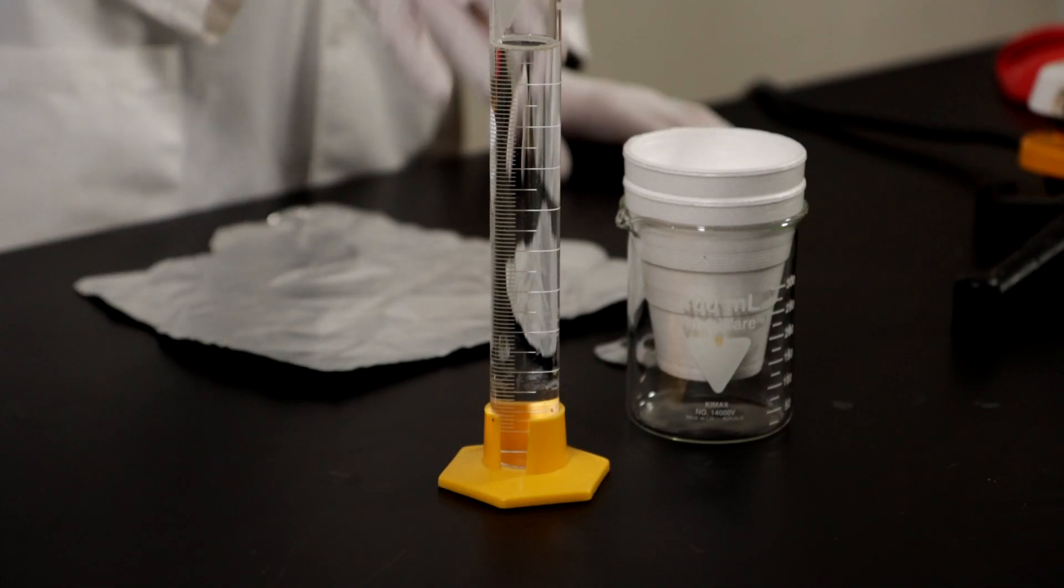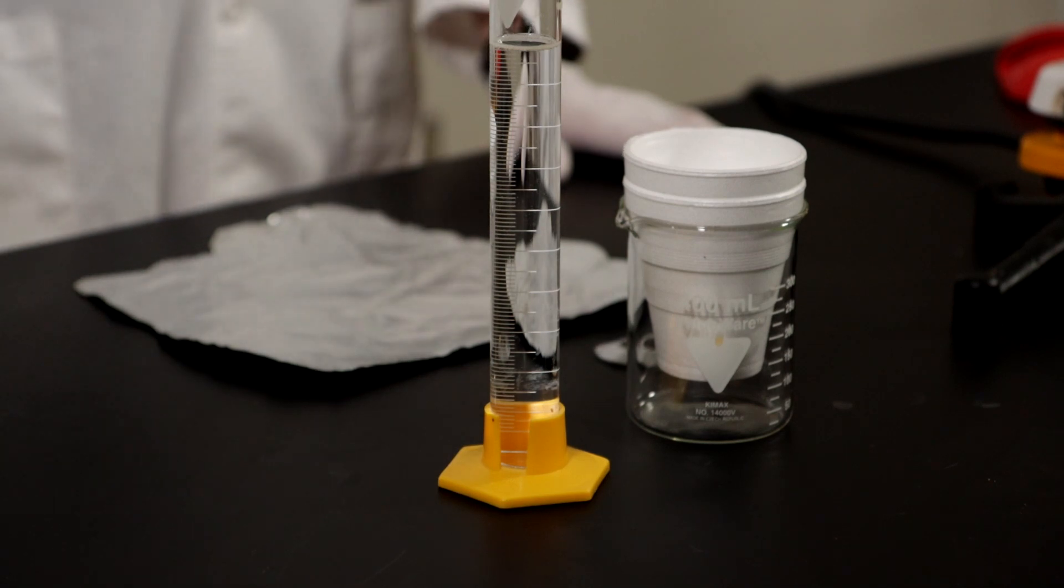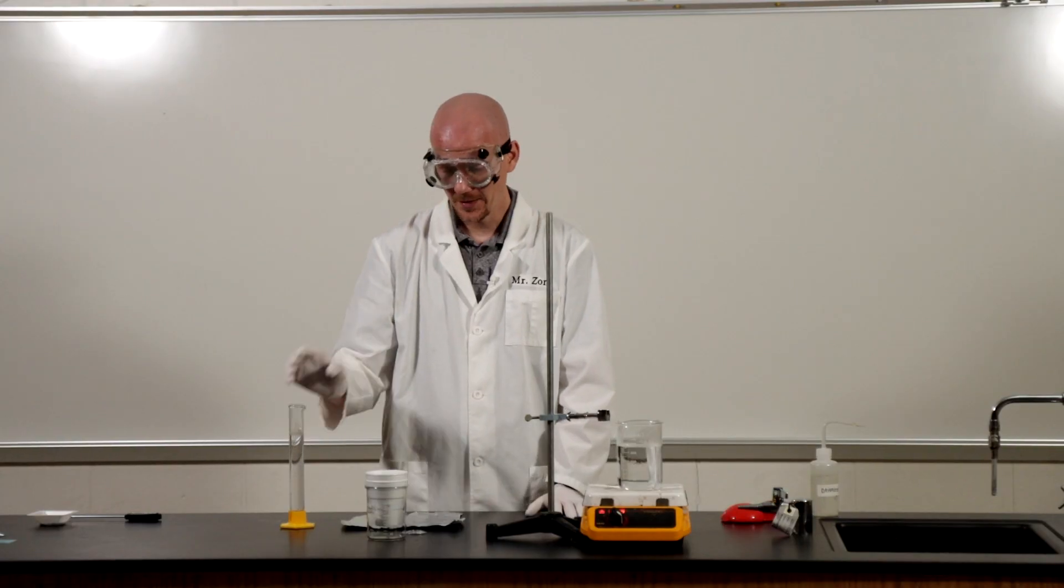What's a calorimeter, Mr. Zorn? That's a great question. So this is a very expensive, very high-tech piece of chemistry equipment here.